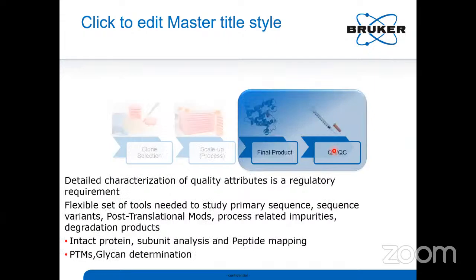If you go to final product, once you have confirmed in clone selection, once you check it in 5 liters, 10 liters, then you will go to bulk production, where it will be 1000 liters, 2000 liters. In that case also, in every step you need mass spec. Why? Because when you are working in clone selection or in 1 liter, 2 liter scale up, it may not go for any modifications, PTM, post translation modification.